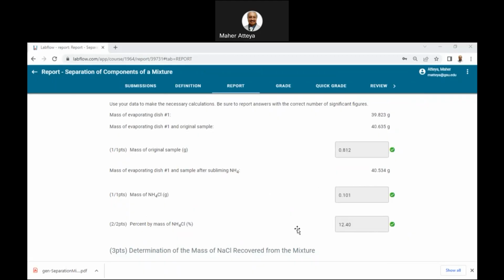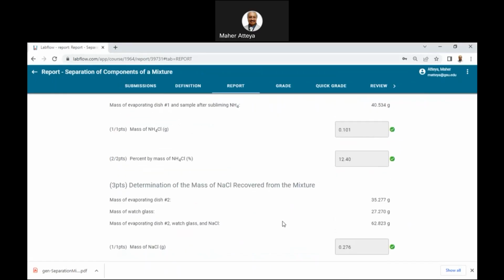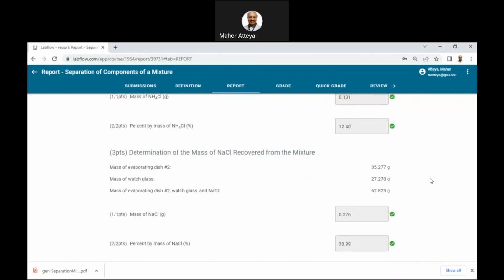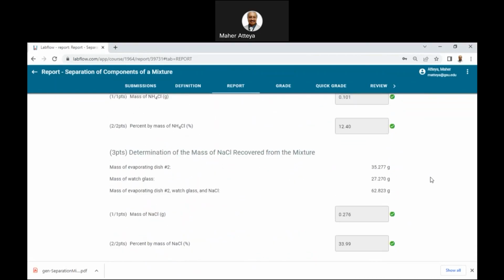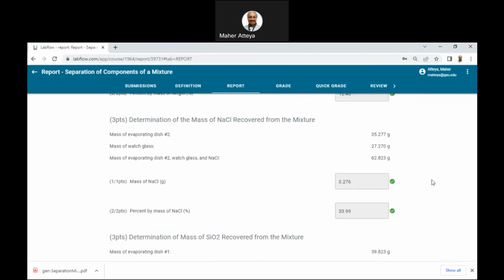First set. Let's go for the second set. It took time, but it's really worth it. So we did this one here, the 4, correct? Now number 3. Take number 3 here, and I need the data with the green.